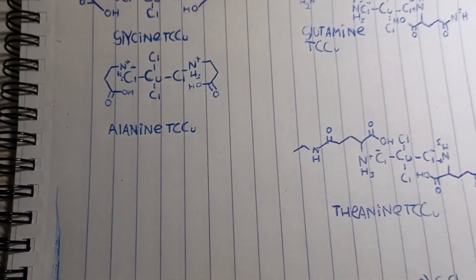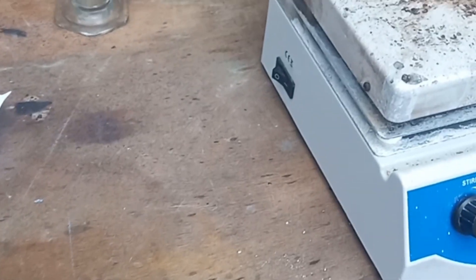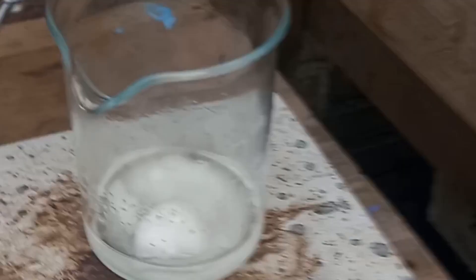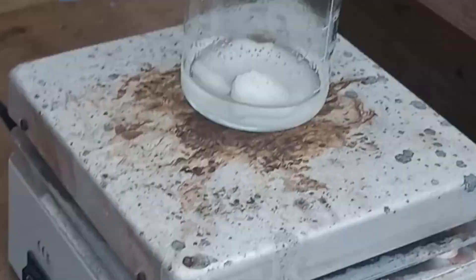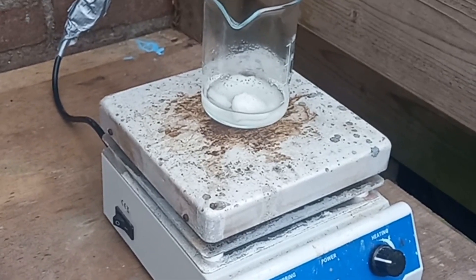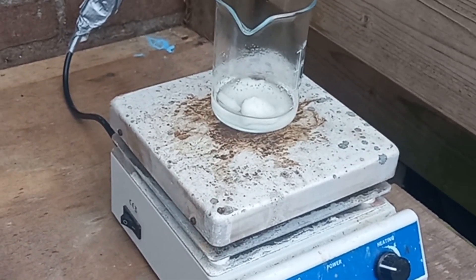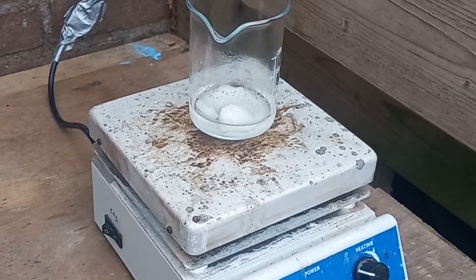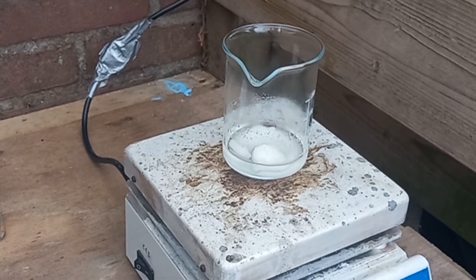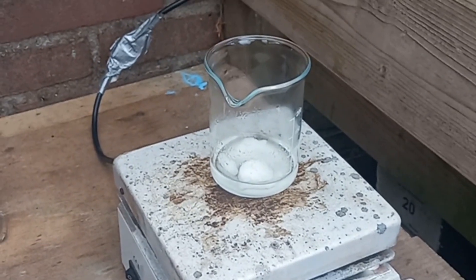I'm making some glycine hydrochloride here — needs some stirring. I need to heat it up a little bit, maintain it at around 50–60°C for a while, then cool it back and filter it. At first it wasn't really precipitating anything, but I froze it and now it's just a solid mass, so I guess that did the trick.